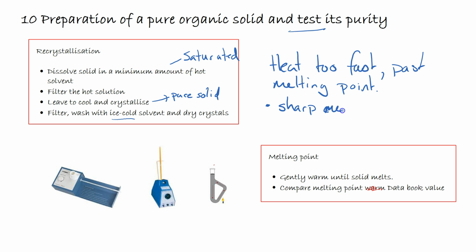If the organic product is pure, then we end up with a sharp melting point with a narrow melting point range. This is because it will crystallize evenly, and there won't be any interaction from other molecules disturbing the intermolecular forces.